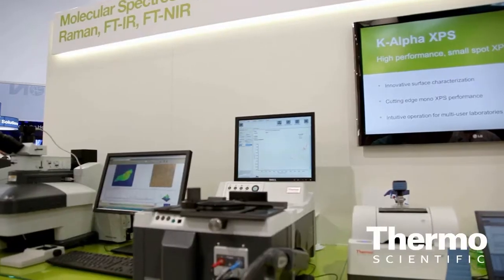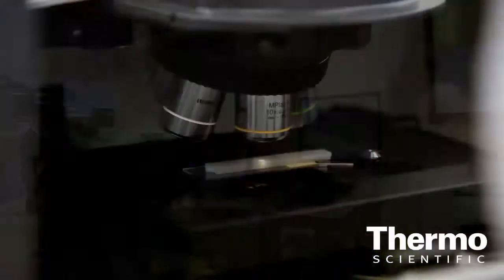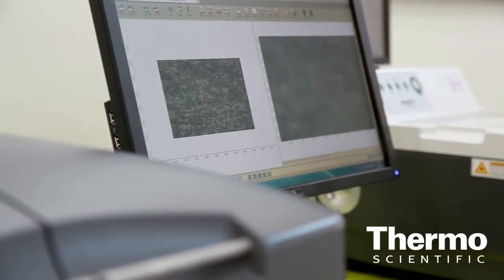With this instrument, you can identify very small impurities, especially in polymers. Or you can identify small fibers in the analytical area, especially in some forensic labs, for example. You can identify very, very small particles down to a size of about 1 micron. And that's very important because you can measure very small particles, and especially here you can identify impurities like this one in a polymer matrix.